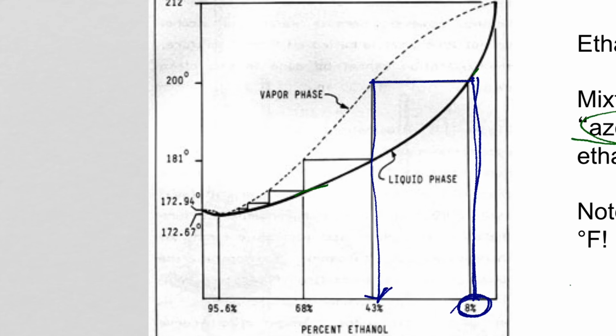And that is one theoretical plate, and you can see that for this phase diagram that would give us about 43% ethanol. And I think most of you, when you were telling us the percentage ethanol in your distillate from the simple distillation, you were getting about 30 to 40% ethanol. So that makes a lot of sense.